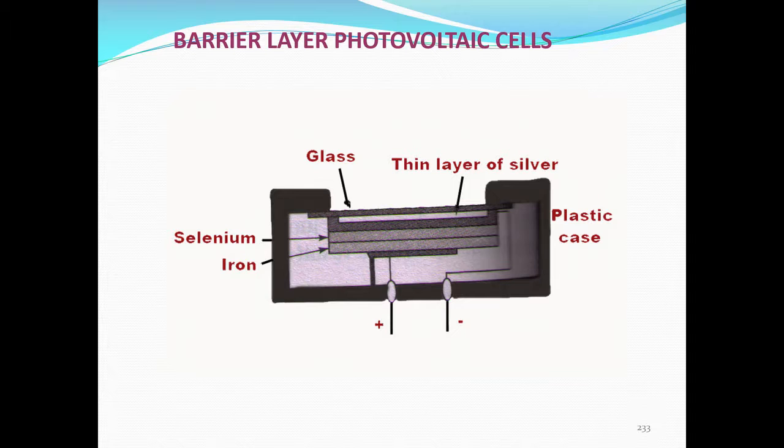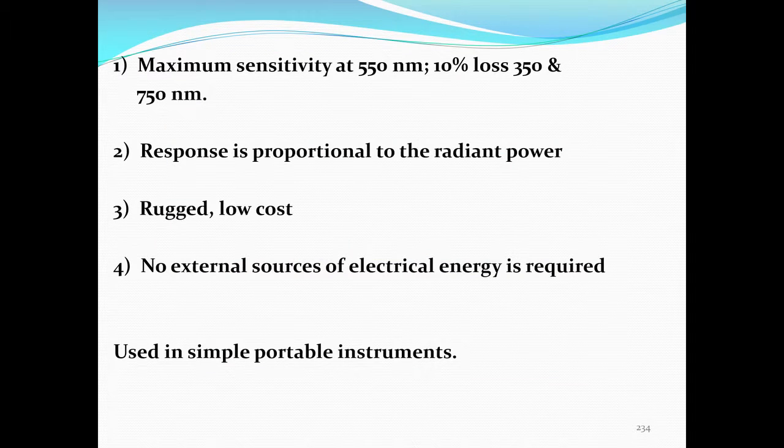So, how does it function? If I know what it is, then I can find out. What happens is, when the incoming radiation is allowed to fall on the semiconductor plate, the radiation falling on the semiconductor plate will generate electrons. Okay.